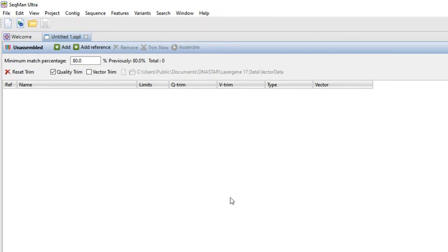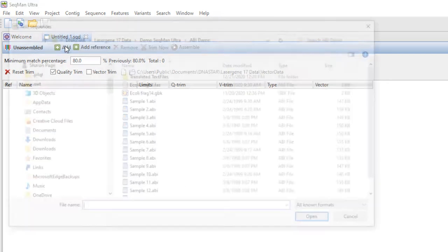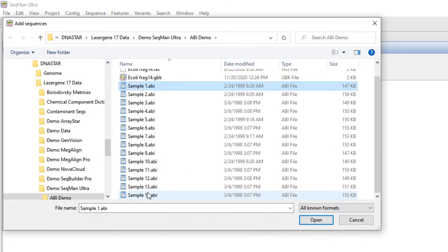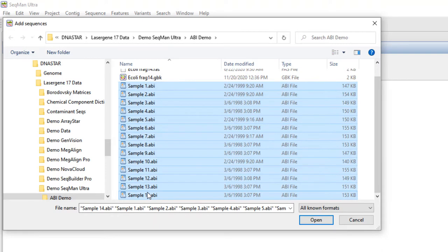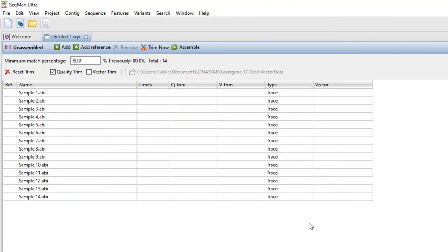Click the Add button to add your read sequences. To add the reference sequence, click the Add Reference button.